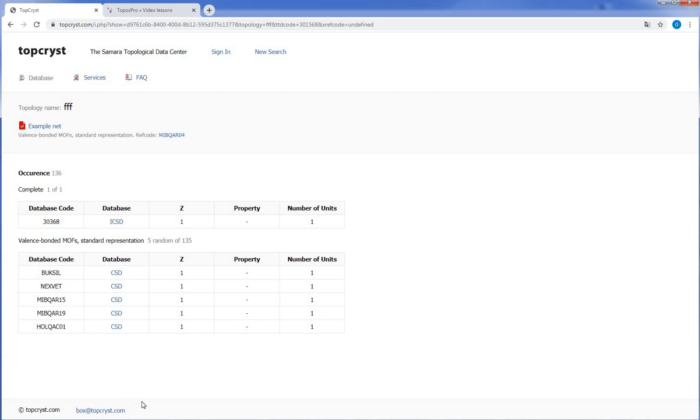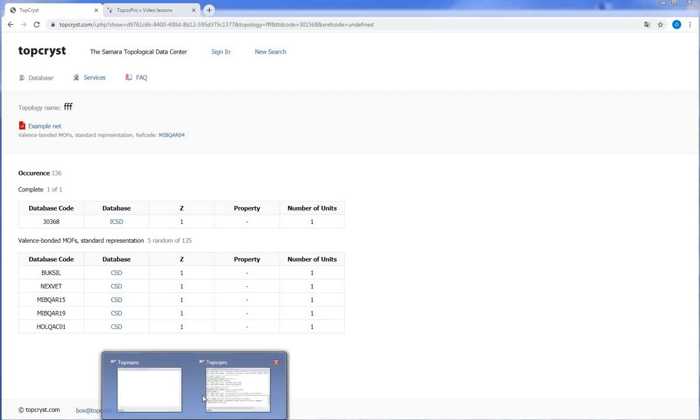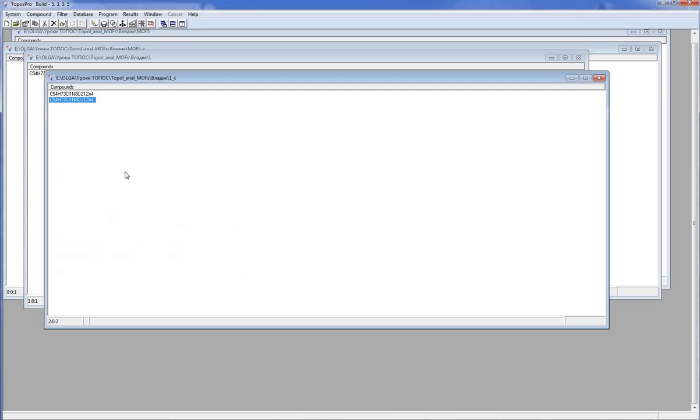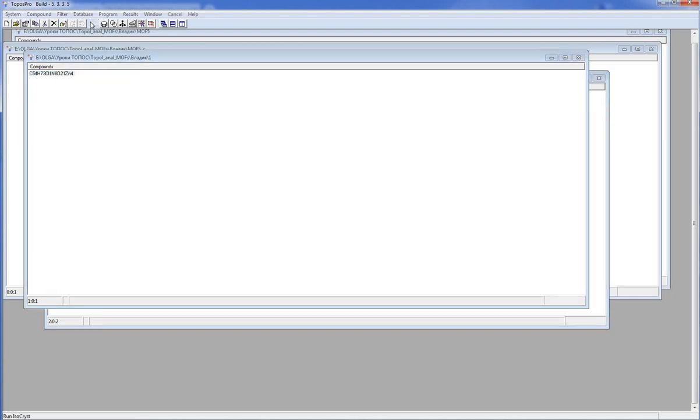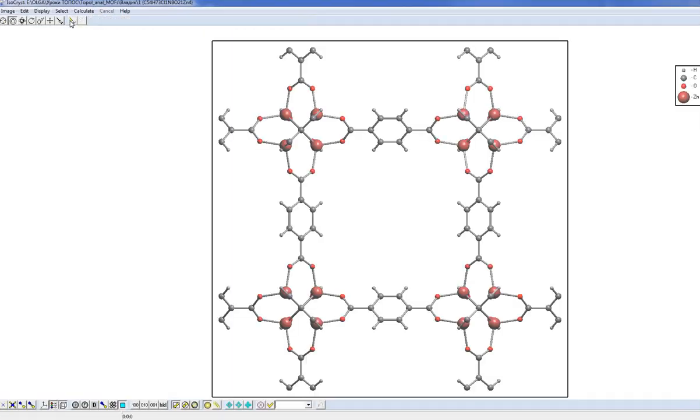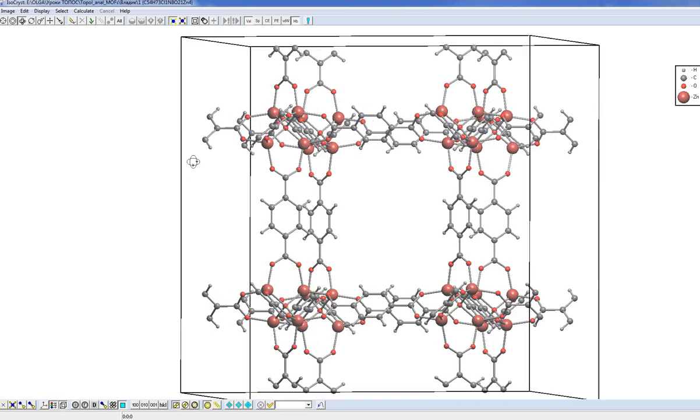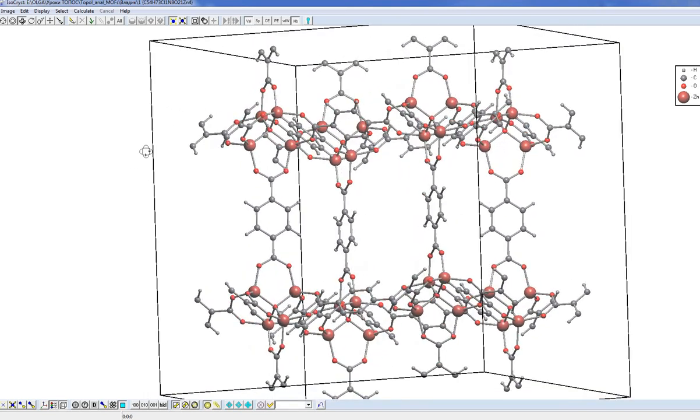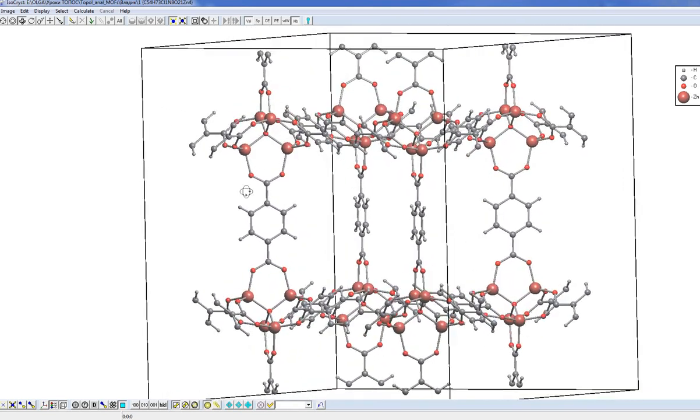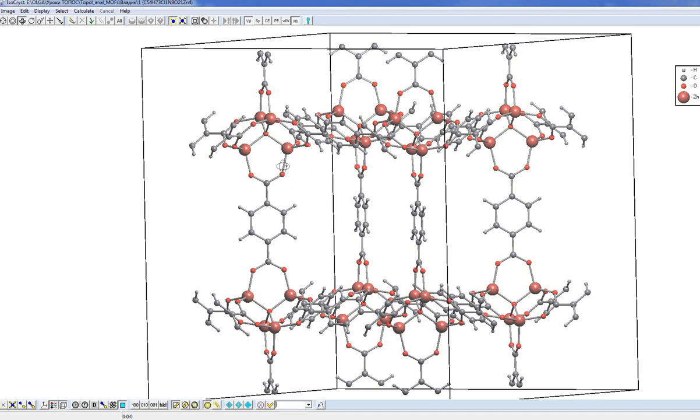We consider here the structure as a set of metal atoms, which are the coordination centers and molecular linkers, which connect these centers together. But we can analyze the same structure in another way. We can select polynuclear complex groups, these tetrahedral groups, as structural units and linkers between them as other units. This is the so-called cluster representation in Topos Pro.